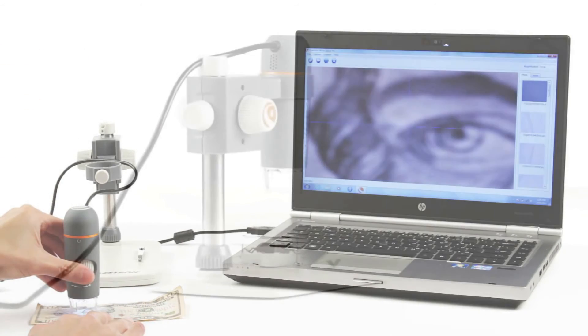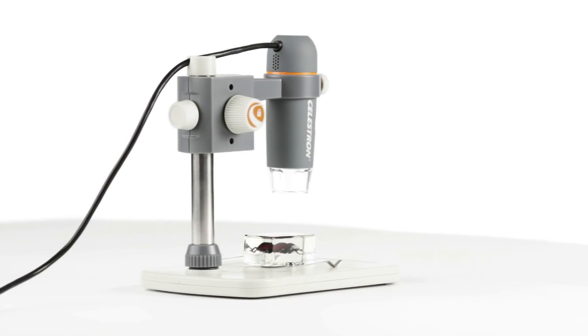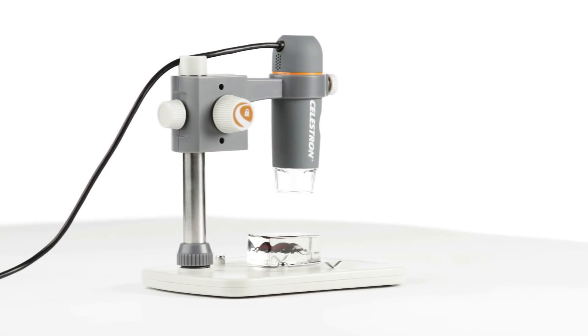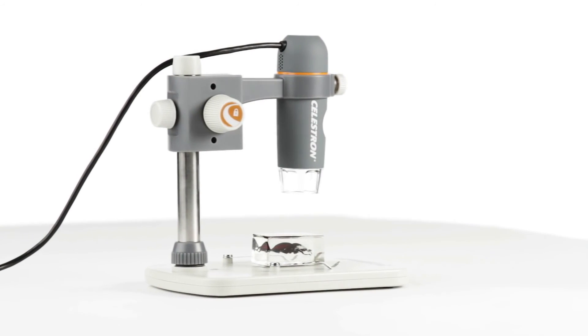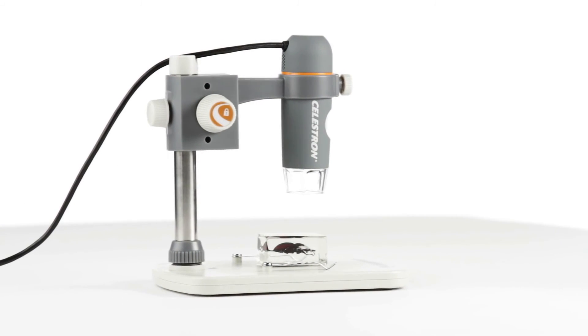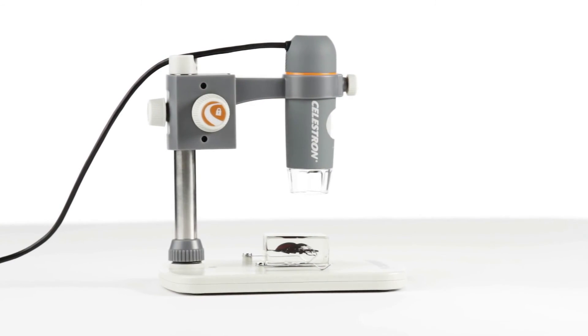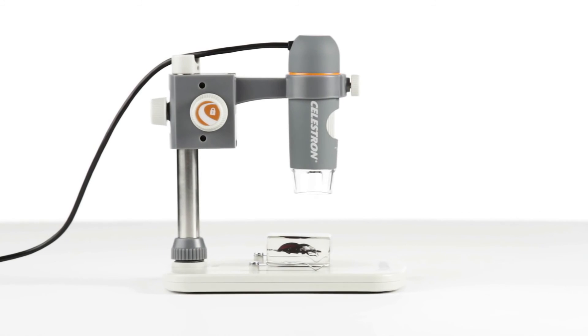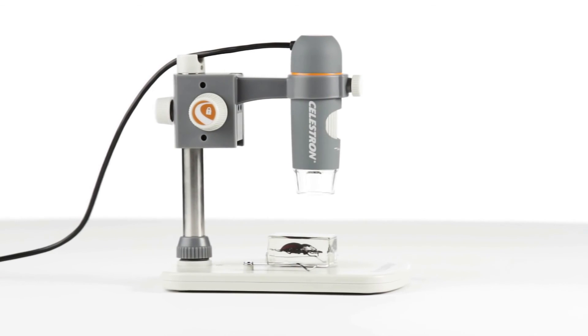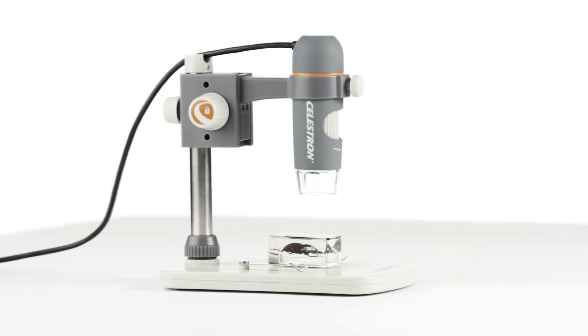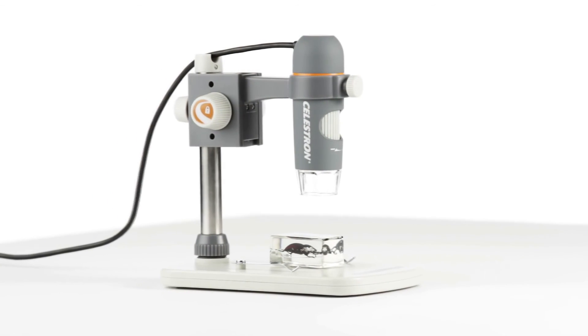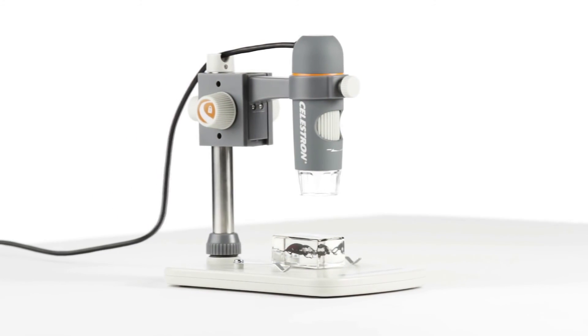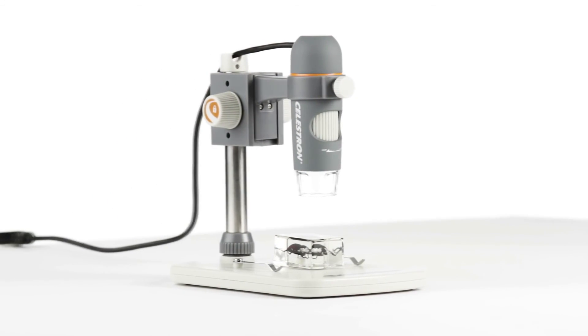For high-quality views and recordings of your specimens, from the workplace to the classroom, you can't beat the versatility, quality, and ease of use of the 5-megapixel handheld digital microscope Pro from Celestron.